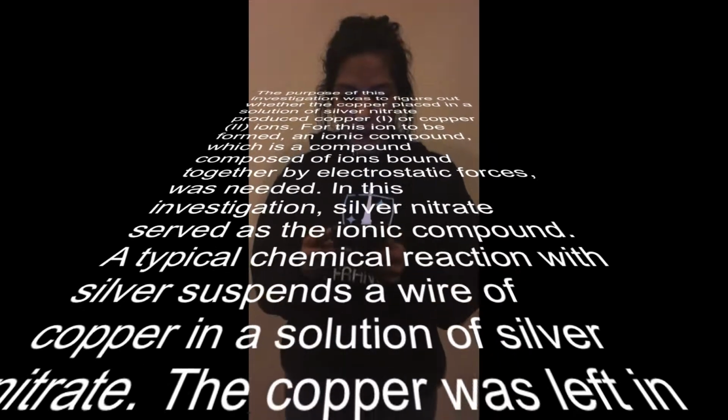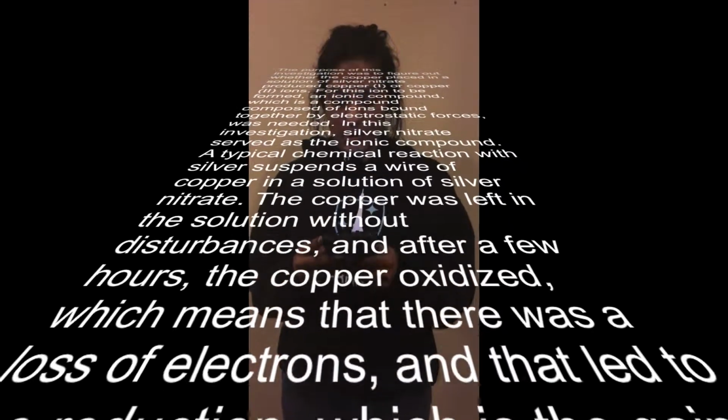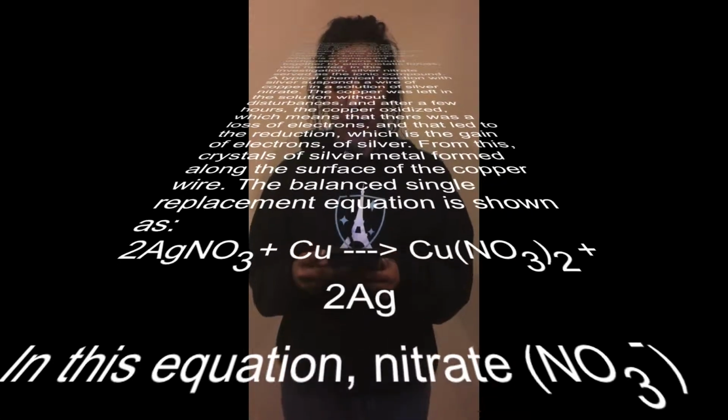A typical chemical reaction with silver suspends a wire of copper in a solution of silver nitrate. The copper was left in the solution without disturbances, and after a few hours the copper oxidized, which means that there was a loss of electrons, and that led to the reduction, which is the gain of electrons, of silver. From this, crystals of silver metal formed along the surface of the copper wire.